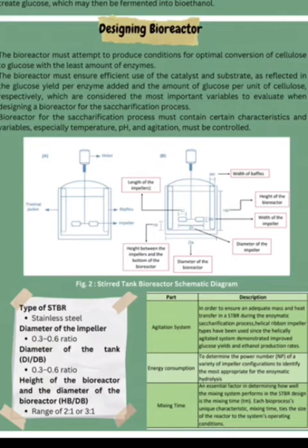A bioreactor for the saccharification process must contain certain characteristics and variables, especially temperature, pH, and agitation.